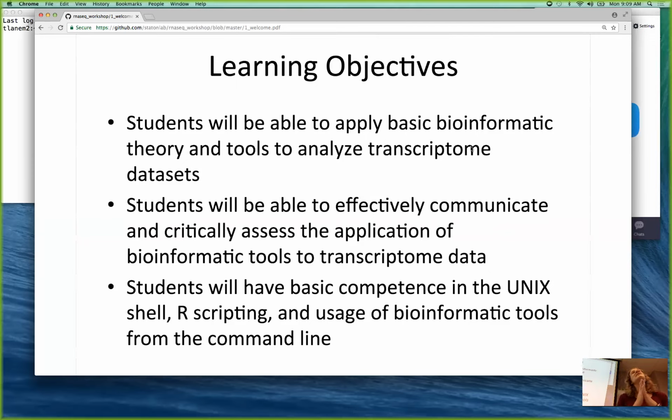We're gonna use a really tiny data set as an example for this class, but I hope one day all of you have 50 files or 100 files or terabytes of data that you need to process. And it's gonna be really difficult to do that through web servers, through an HTTP connection. You need to be able to get on a supercomputer. You need to be able to leverage those hundreds of computing cores that UT is going to invest in and has been investing in. And the best way to do that is from the command line.